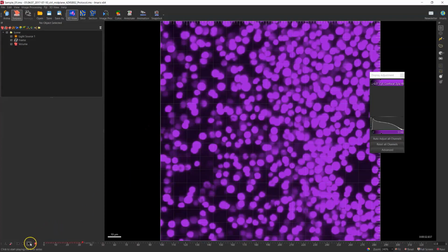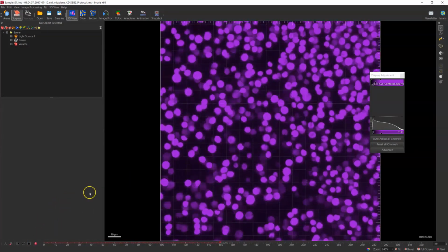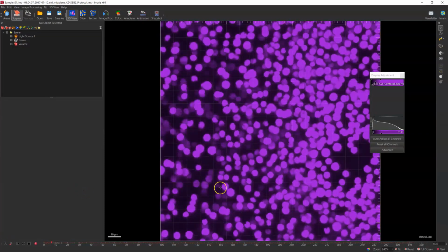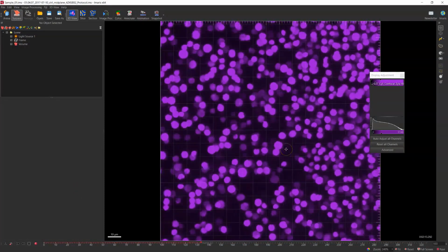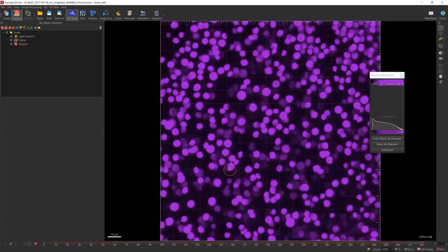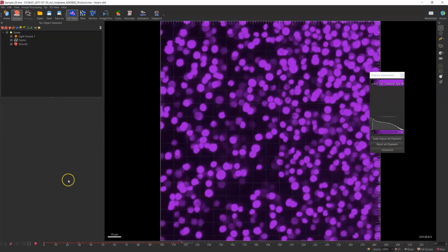Here you can see a lot of spots are moving around. And we want to ask two questions. First one, whether the intensity is associated with the spots aggregation level, which we can now measure using the average distance to 3 nearest neighbors statistical value. And the second one is whether the average speed of movement is associated with intensity level.